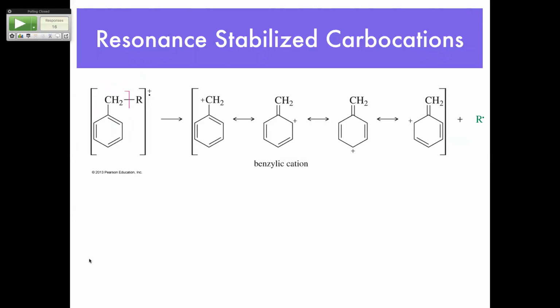Okay, this is a carbocation that is benzylic. Benzylic and allylic, in particular benzylic, will give you big peaks on the mass spec. Okay, so what's the weight of the benzylic carbocation? Let's figure that out. Okay, so this is what we're looking at.